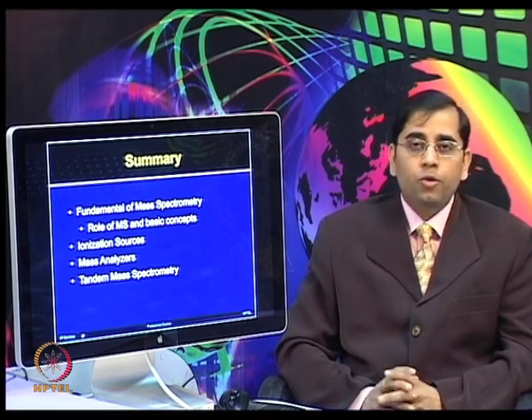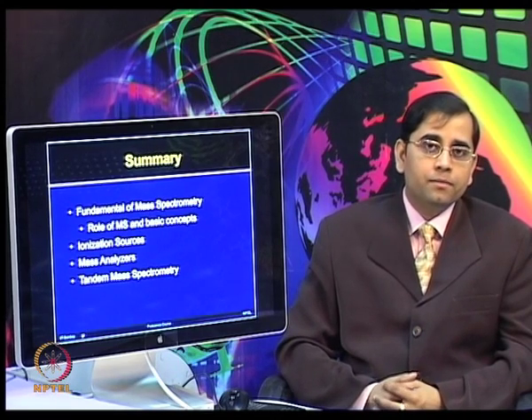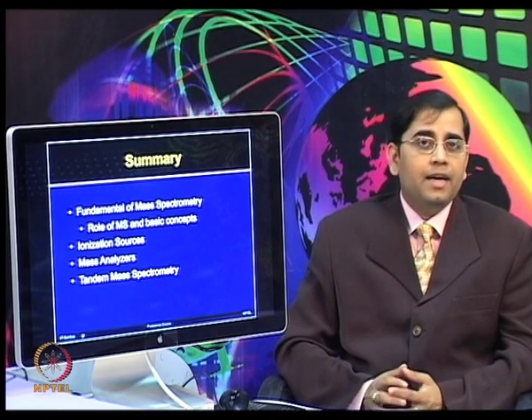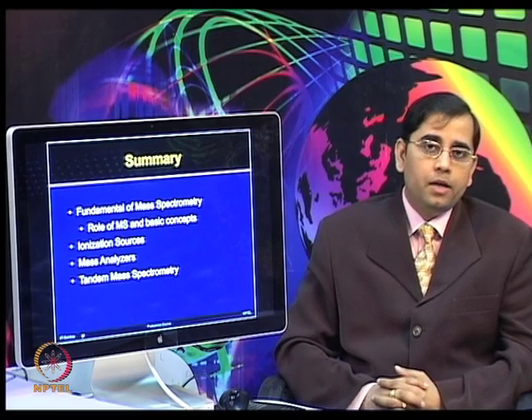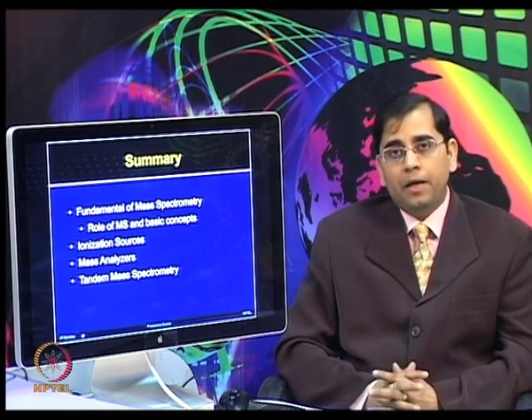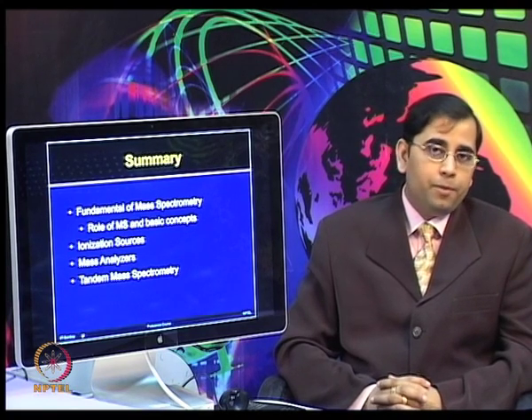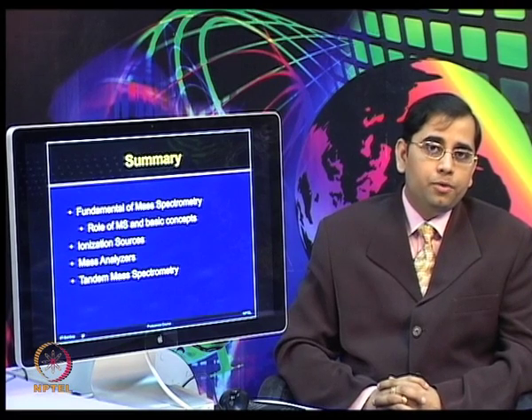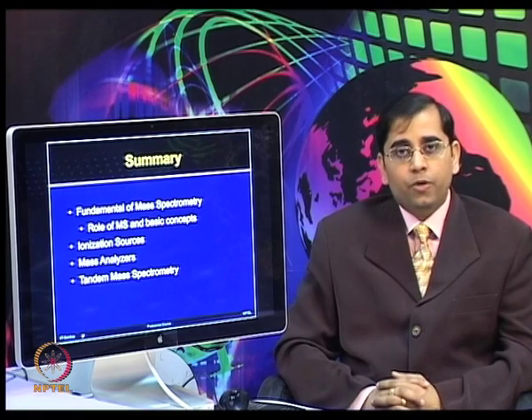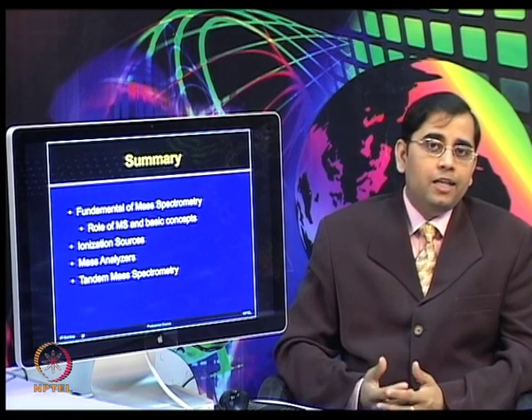One can also use a modular design, where different types of ionization sources can be combined, such as ESI and APCI. Targeted analysis can be performed for PTM, label free quantification or MRM type of assays. So, from your ideal mass spectrometer, you would like to have a wide range of applications, and that is only possible if it has very high specifications.